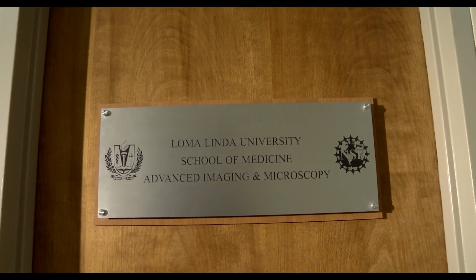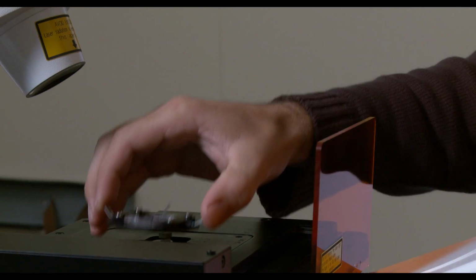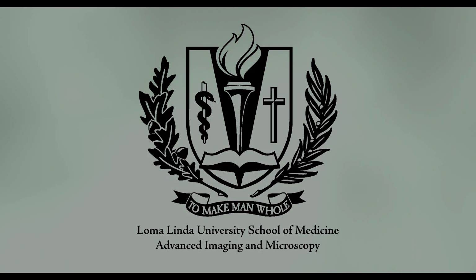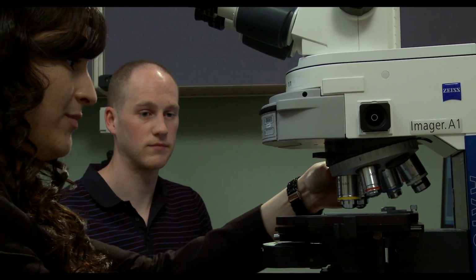This advanced imaging and microscopy core is a powerful tool in advancing science and in helping us change our whole concept of life in the world. Some of the best things about our facility is that we have a very friendly and knowledgeable staff, and we have very high quality equipment that allows people to generate the images that they need for research publications.